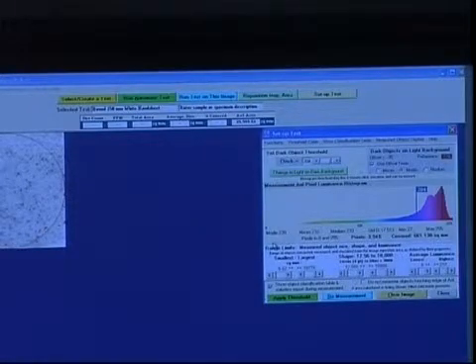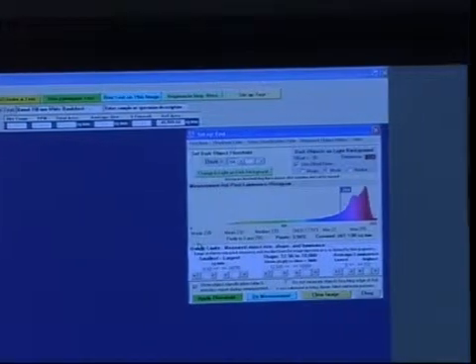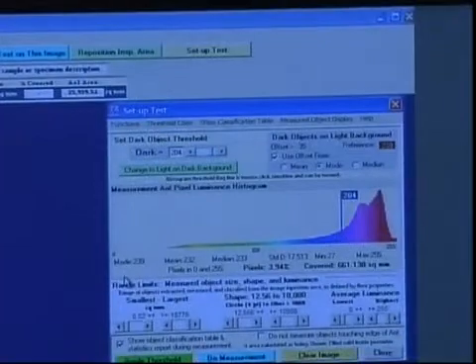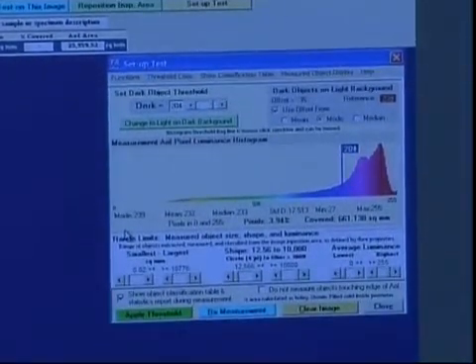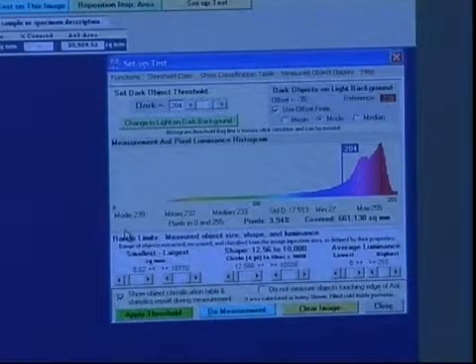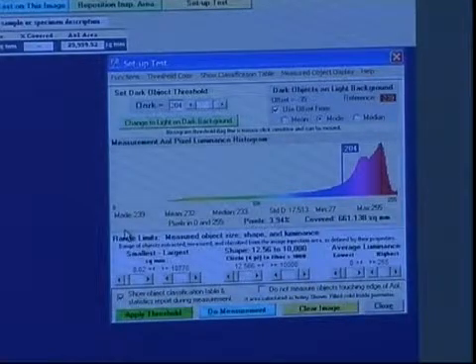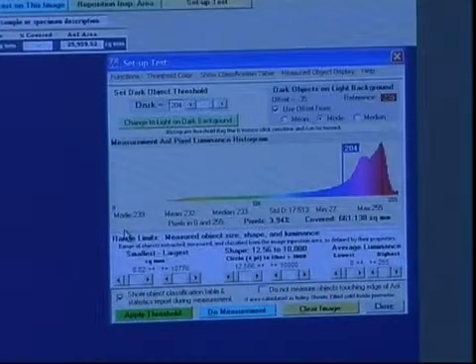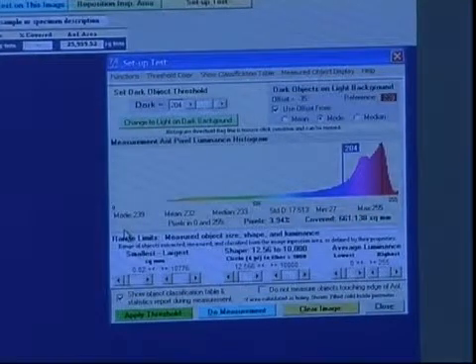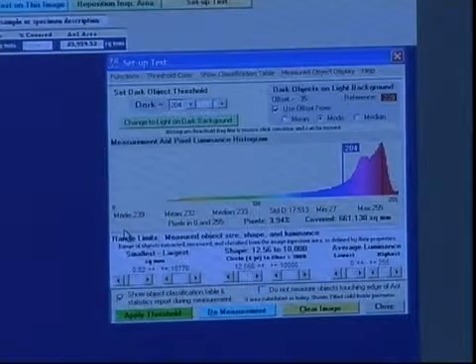Now, what is the mode? Many people do not understand this. Statistically, this is the most populous pixel color. It is the one that is most prevalent in the hand sheet. The mean, of course, is the average pixel intensity, but the mean includes also the dirt, the very thing that you're trying to measure. The mode is more typical of the background because it's the most frequently occurring intensity.